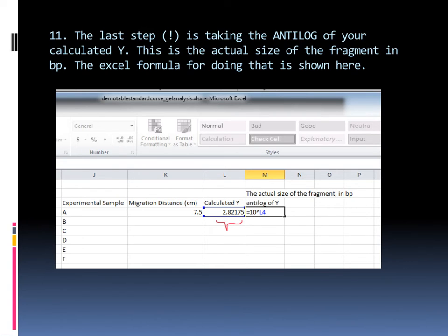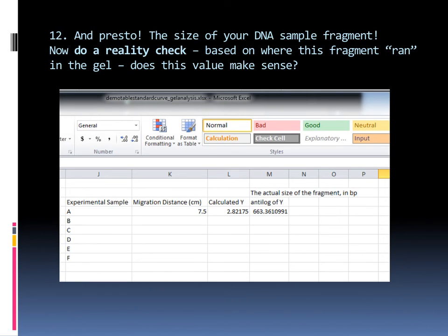And now we want to know the actual size of the fragment in base pairs. And you can determine that by taking the anti-log. Okay, so this is taking the anti-log of that value. You type in equals 10, you put the little caret in, and then you use Excel, it says L4, which tells it to draw data from there, and you hit return. And now, presto, we've actually got data that's directly of interest to us. So this says that the DNA fragment that was in lane A, which was an experimental sample, was 663.36 base pairs long. So that is in units of base pairs, common units for DNA measurements.